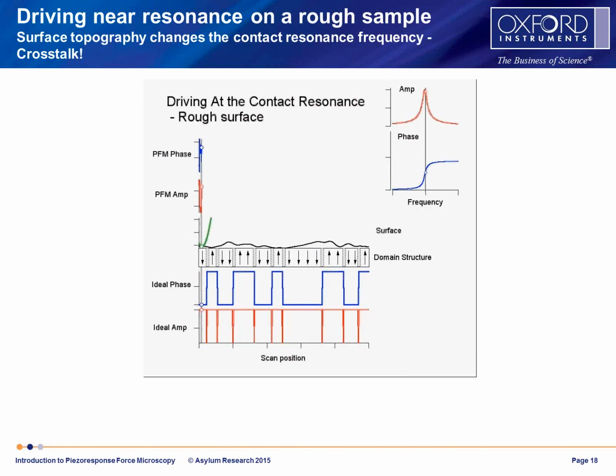So there's your tip going. And as you can see, there's a lot less jaggedness in the phase response. It looks pretty smooth. What the heck is happening there?